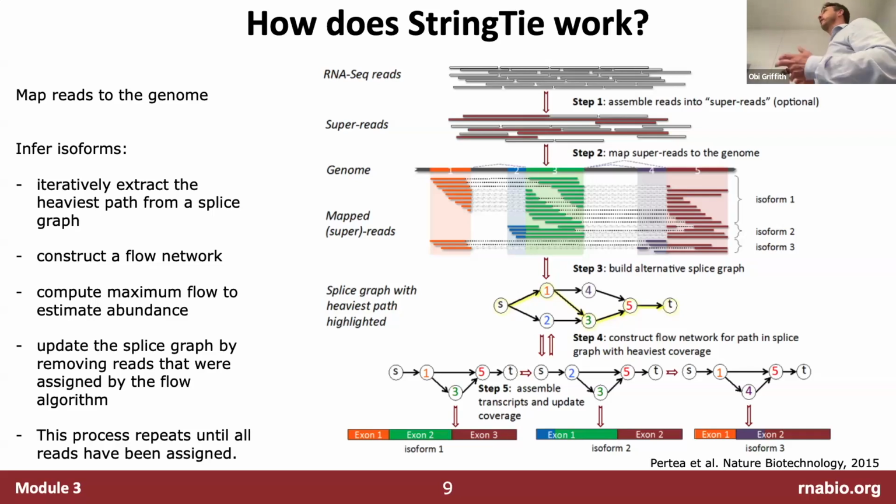Like to do a sophisticated pathway analysis at the transcript level rather than the gene level, there may not be enough information or tools to do that. But nevertheless, it's important to think about and consider doing transcript level. And StringTie is a really sophisticated attempt to do that.